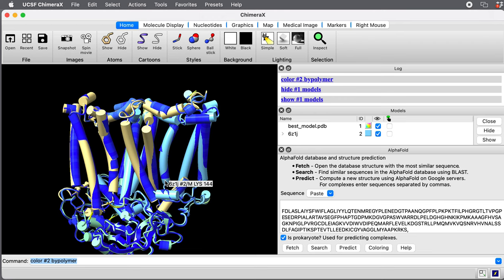And one last problem that this Google Colab service, it was using the 245 gigabytes of sequence data to find the multiple sequence alignments, whereas the full AlphaFold uses two terabytes, almost 10 times more sequence data. And one further limitation, the Colab version doesn't use structure templates from the PDB, whereas the full AlphaFold version described in the paper does use the structure templates of the individual monomers.